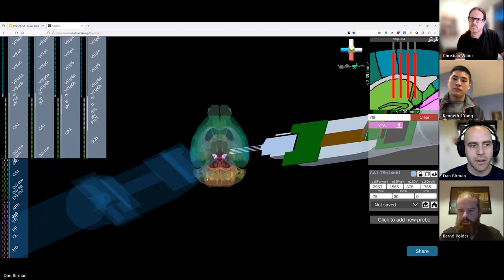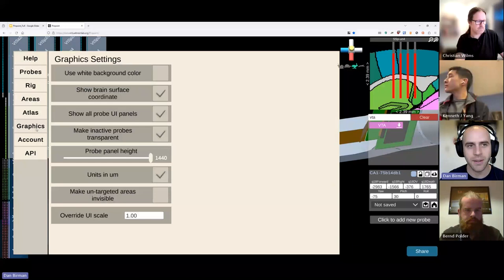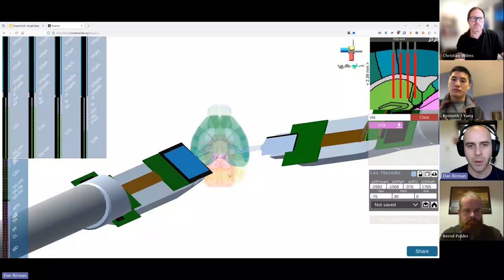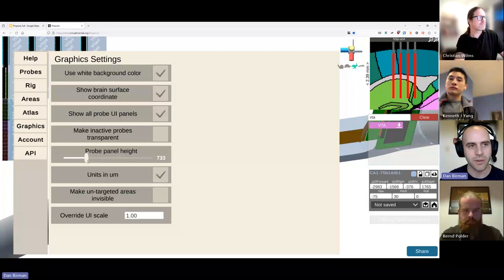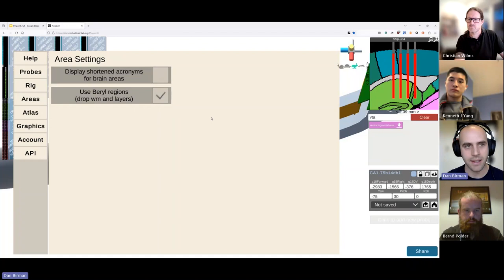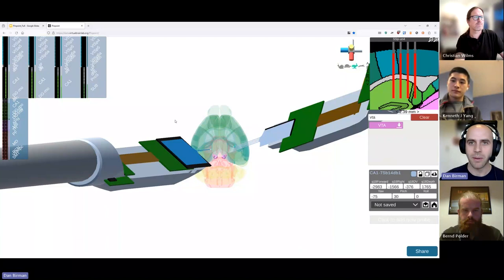There are lots of other settings hidden in here — convenience settings like the ability to set the background color to white for making paper figures, options to change whether other probes are transparent, and the ability to shrink the probe panels. If you want to see full names of areas, that setting is in there as well. Feel free to reach out if you ever find bugs, because we are continuously developing Pinpoint and are always looking for feedback to help us improve.